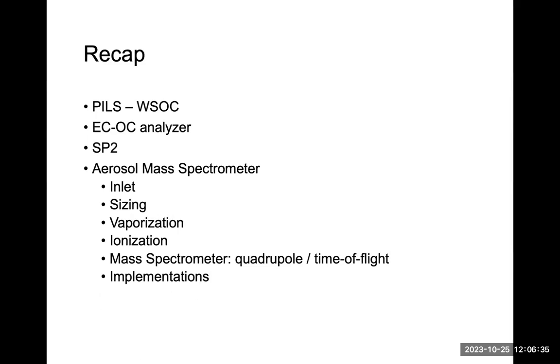So this class, we're going to discuss the aerosol generation and calibration systems. We have covered so many types of the aerosol instruments, but how do we make sure that they're actually measuring the right quantity, right? For example, we know that the size distribution is being measured by the SMPS.